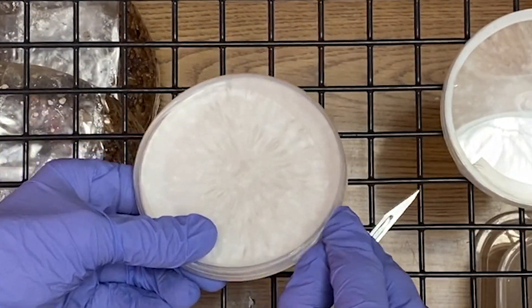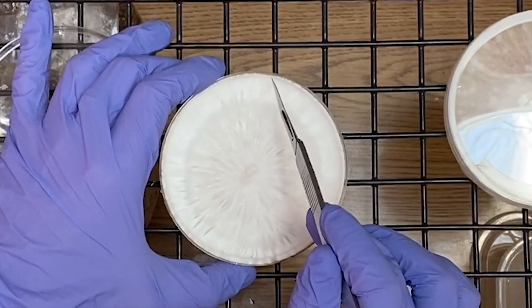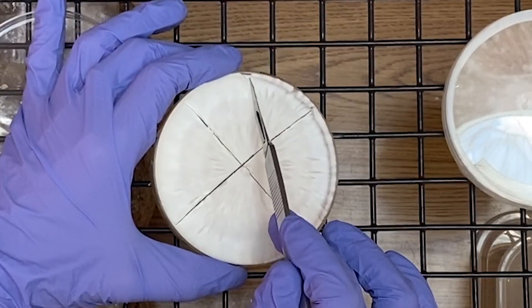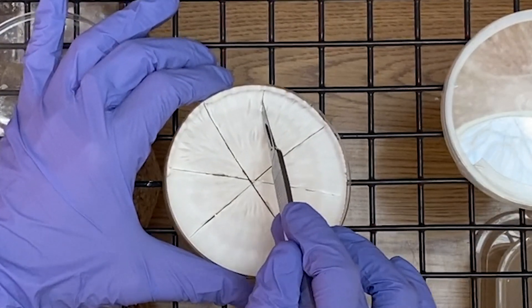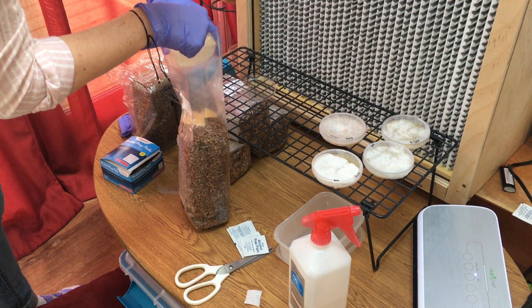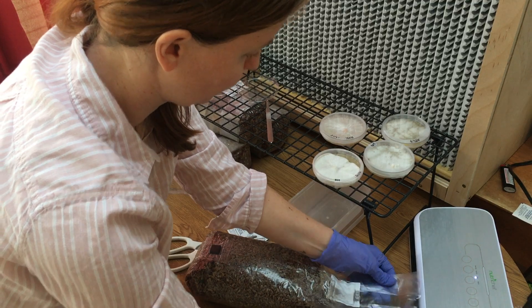Now it's time to prepare the petri dish. First, remove the parafilm and then open the lid. Next, cut eight wedges in the dish. I like to break up the agar like this because I think it colonizes a lot faster when we transfer it to the spawn bag. Carefully transfer the agar to the spawn bag, and with a vacuum sealer, seal the top of the bag but do not vacuum out the air — just seal the bag.